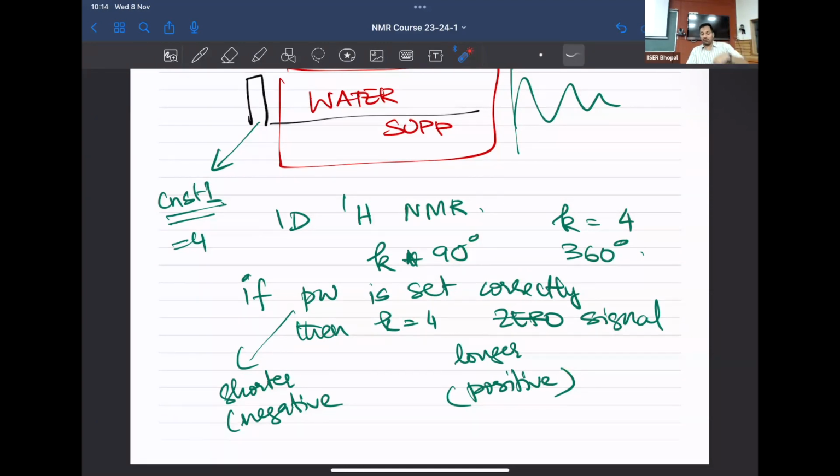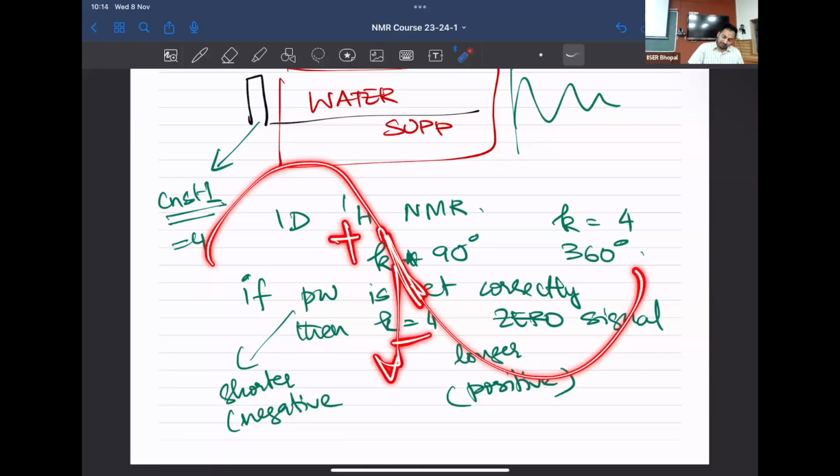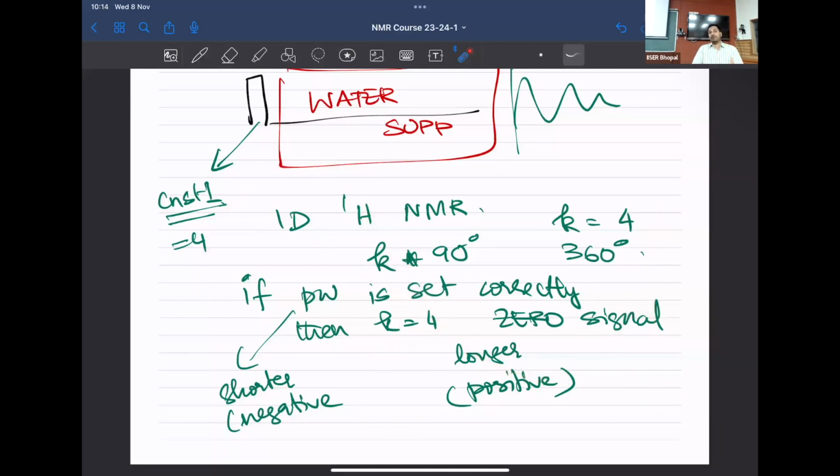On the other hand, the zero crossing, if you're trying to look at the sine function, it goes from positive to negative around 180 degrees and negative to positive around 360 degrees. So the slopes there are so much higher. Therefore, any small changes could be caught. So therefore, I ended up taking 360 degrees.